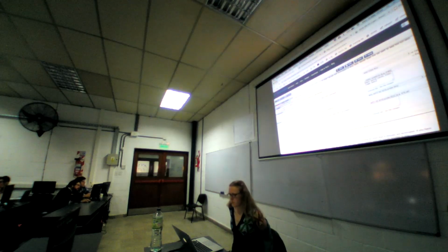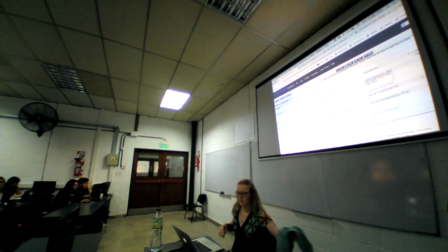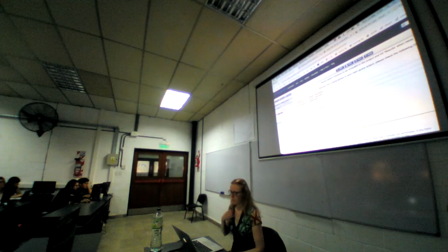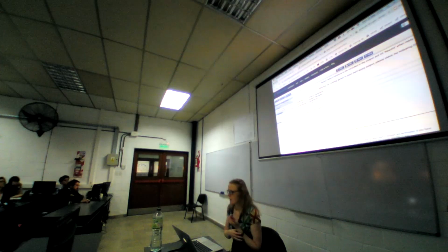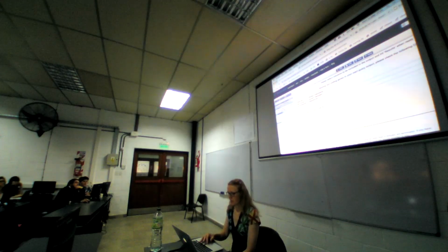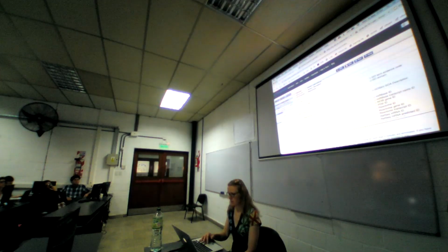And now I can go into attributes and specify what I want to see in my output table. At the top you have different options ranging from features to sequences. I will stay in features for the moment. And I said I'm interested in GO terms and NCBI gene IDs. These are both under external because they come from other databases. So I expand external and select the GO term accession, name and definition. And then under external references, the gene IDs, NCBI gene IDs.